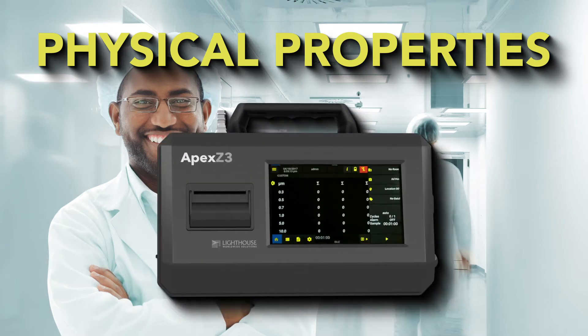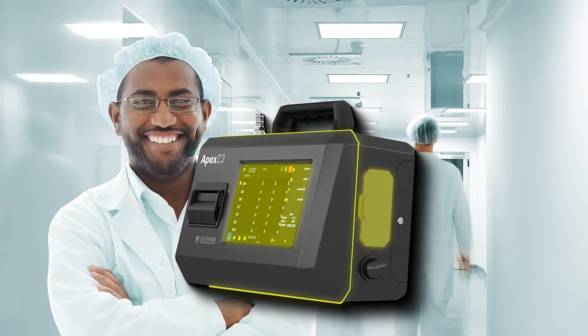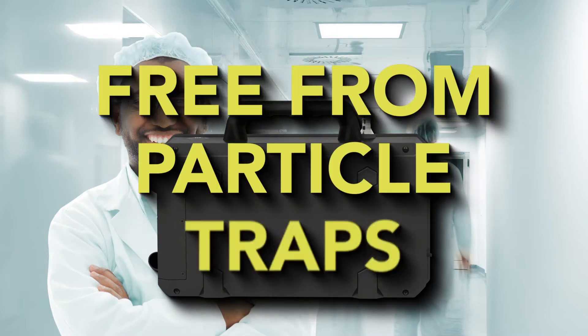Supercharge your cleanroom monitoring with the Apex Z3 and Apex Z50 portable particle counters from Lighthouse Worldwide Solutions. With a sealed enclosure, communication ports, and color touchscreen, the Apex Z is easy to wipe down with common cleanroom cleaning solutions and is free from particle traps.